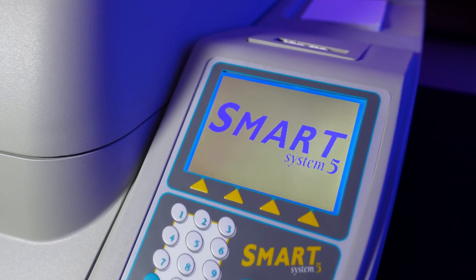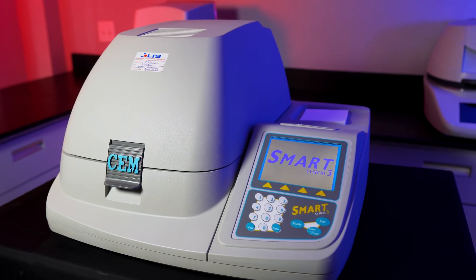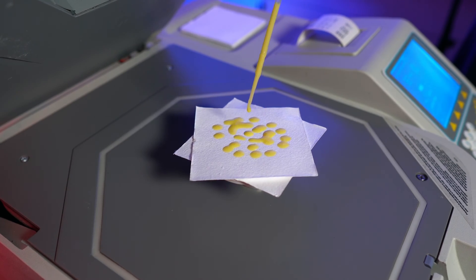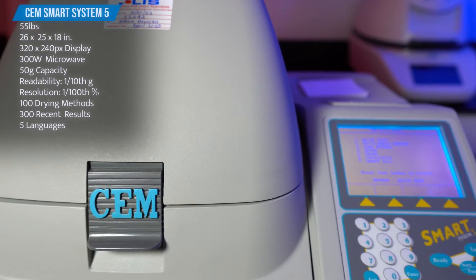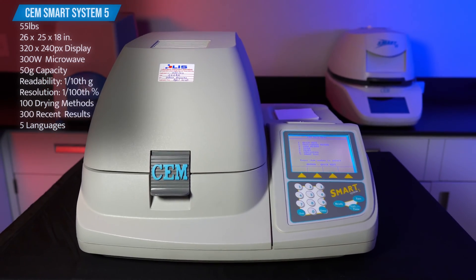This is the CEM Smart System 5, introduced at the turn of the century in 2000, but designed to rapidly test moisture or solid content of a variety of products, from dairy, meat, processed foods, to wastewater, personal care products, pharmaceuticals, paint, and many more. The instrument weighs 55 pounds and measures 26 by 25 by 18 inches.